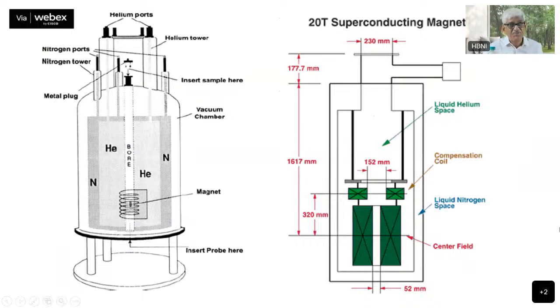Superconductivity means if you have a current going in a superconducting coil, it will remain forever. It doesn't decay, because it has zero resistance. A superconducting coil has zero resistance. Therefore, it has no dissipation of energy. Energy dissipation is what? I squared times R, right?